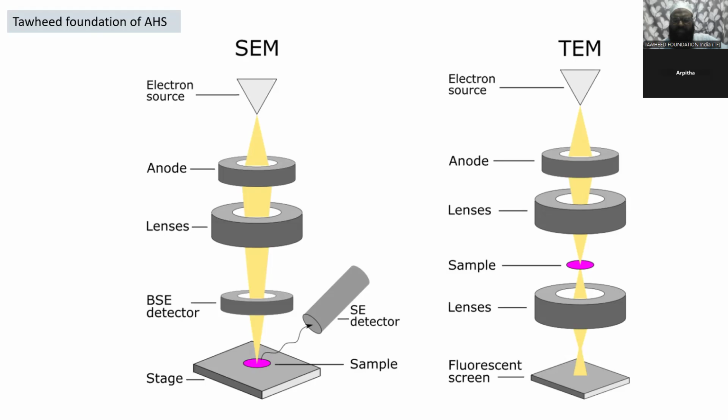The electron beam passes through the specimen and electrons are scattered depending upon the thickness and refractive index of different parts of the specimen. The denser regions in the specimen scatter more electrons and therefore appear darker in the image, since fewer electrons strike that area of the screen. In contrast, transparent regions are brighter.